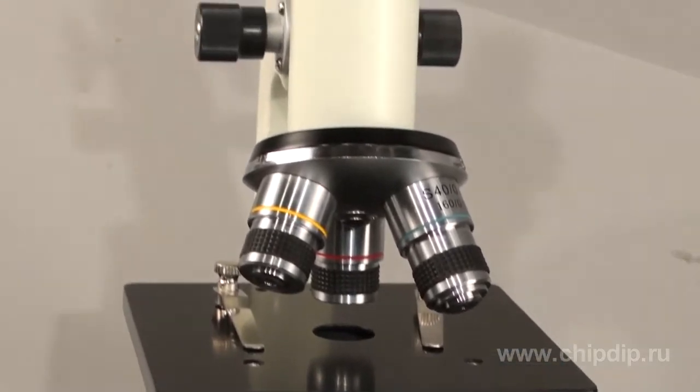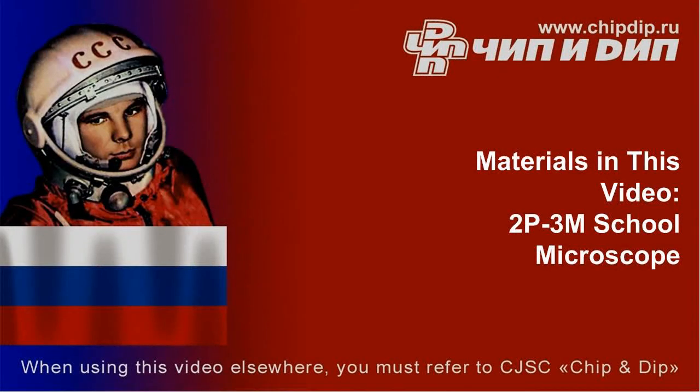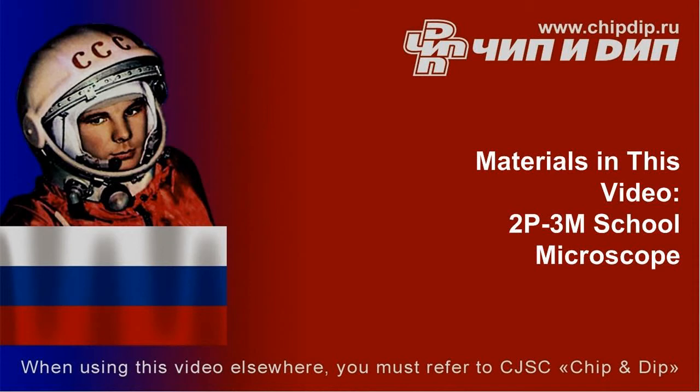Keep the microscope clean and prevent mechanical damage, and it will serve you for a long time, offering fascinating trips to the micro world. Thank you.